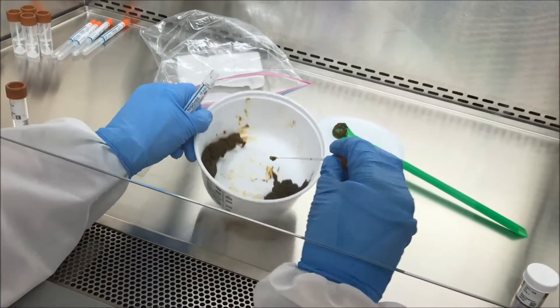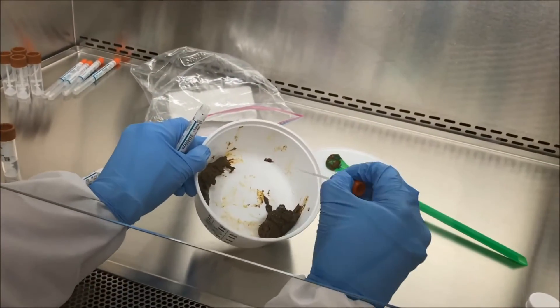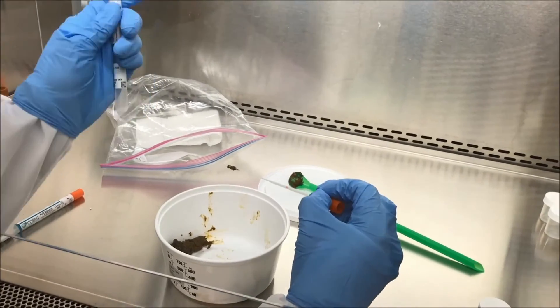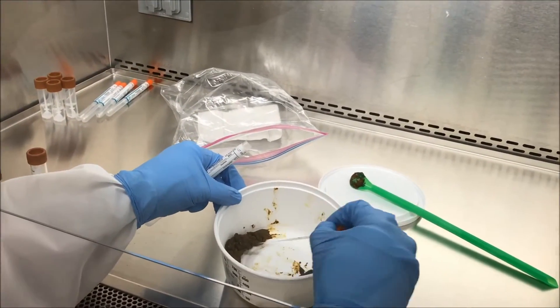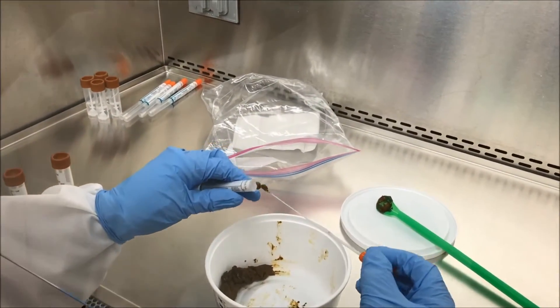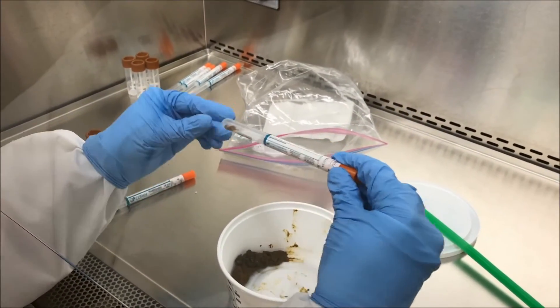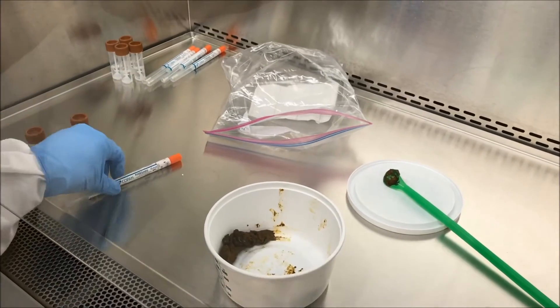If the stool is really hard, like this part of it, we try to chip off a little piece and put it into the tube, into the swab tube itself. So that when we go back to it for DNA extraction, we can just put that piece of stool into the extraction well. So there's one.